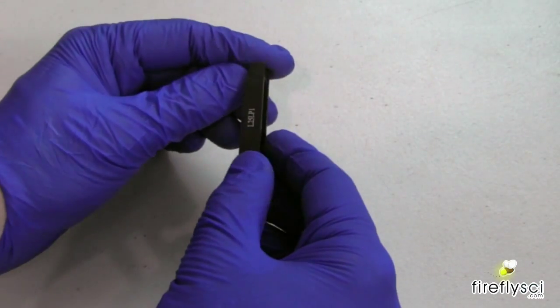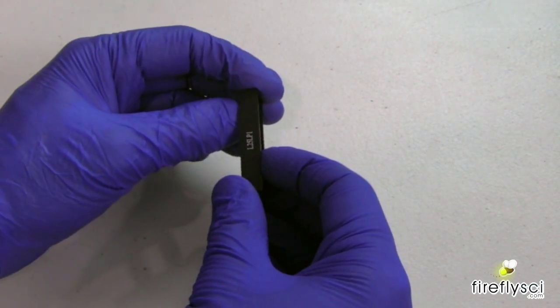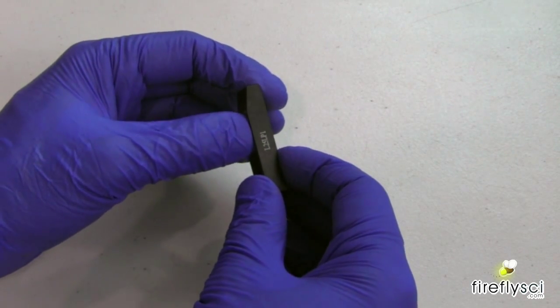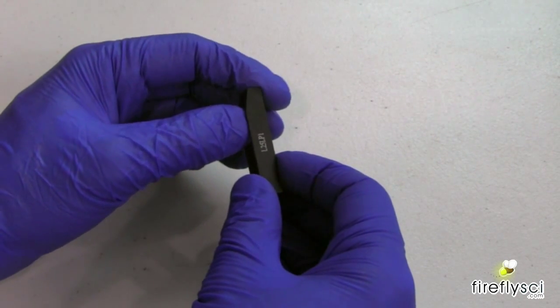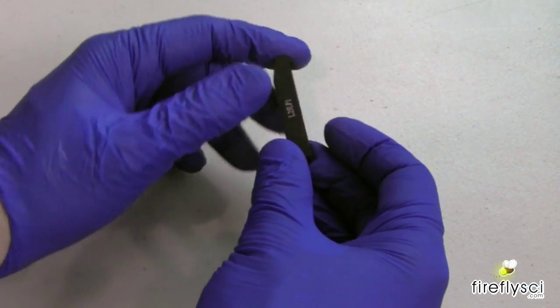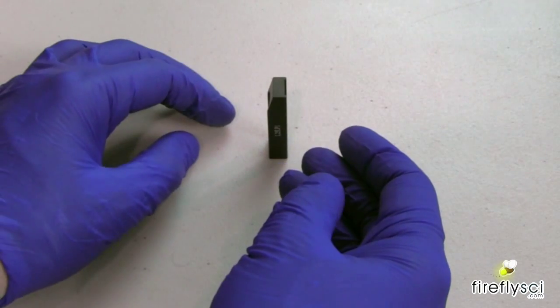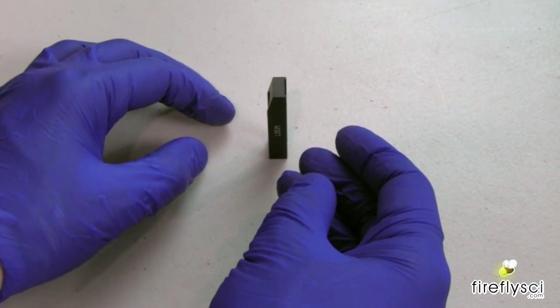Here we have our L25 spacers. So what this does is it helps fill in the gap if you have a small light path that you've got like a one millimeter, two millimeter, five millimeter cuvette. What you do with this is you put it down into the spectrophotometer cell holder, and then you can insert the small light path cuvette, and it'll stand straight up in the holder.